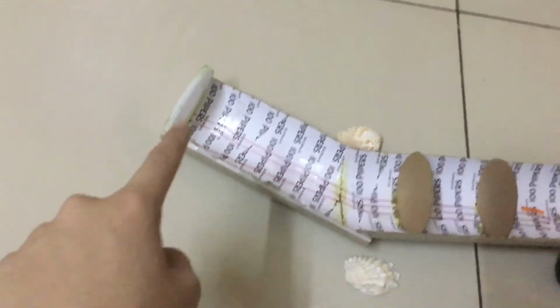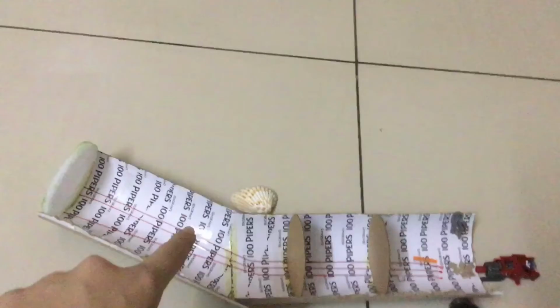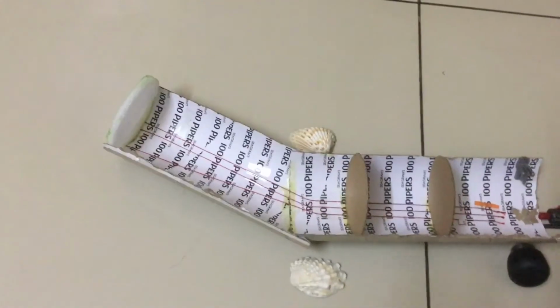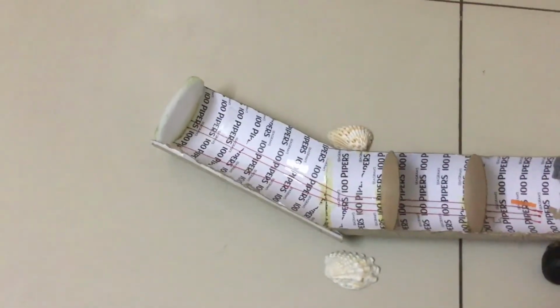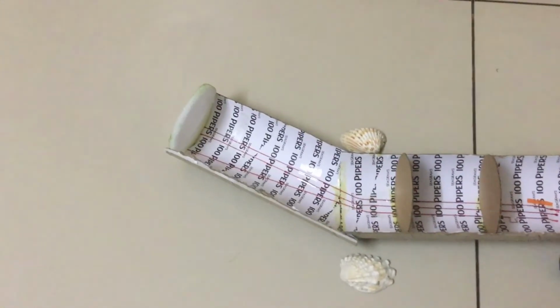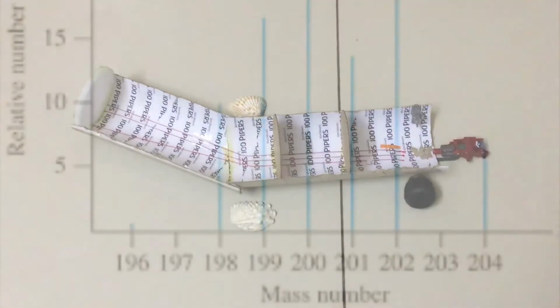And then we come to the last part of the mass spectrometer, which is this detector. And what this does is it is able to pinpoint at which location these beams hit the plate. And using that, it is then displayed on a computer, and by reading those readings, we are able to determine what the different isotopes and the masses of the element are. That's how the mass spectrometer works.